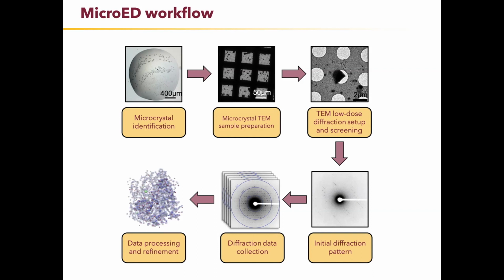And we do this the same way you do it with single particle: you put it into a plunge freezing device, either a manual homemade one or something like a Vitrobot, and you would blot it with filter paper, remove the excess liquid, and then immediately plunge into liquid ethane and vitrify your sample. Now, at this point, you'd leave your sample under liquid nitrogen to keep it cold, and then you'd load it into a cryo-electron microscope, and you initially screen the grid.